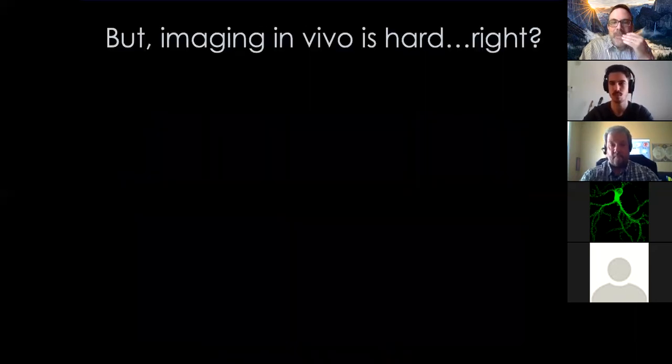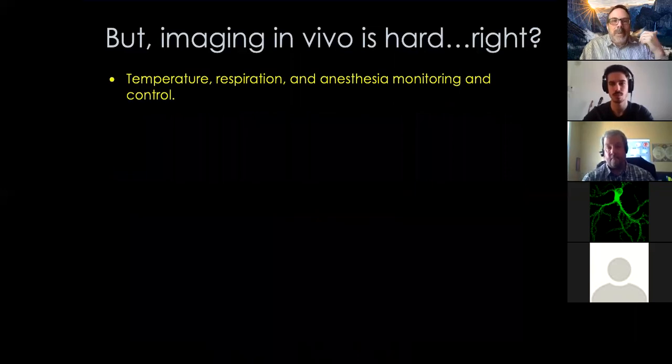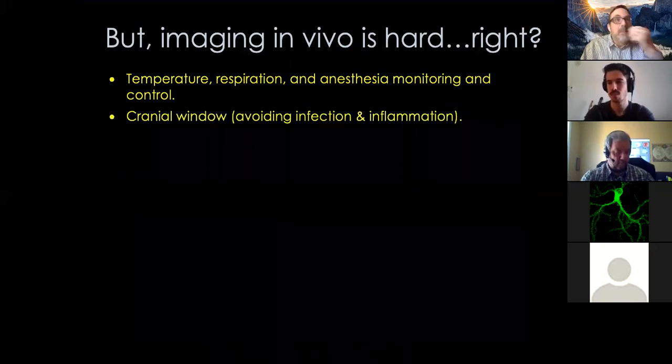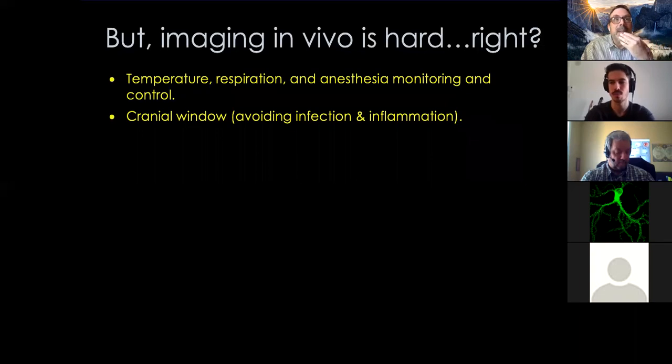But it's hard to do in vivo imaging, right? So if you put a mouse under a microscope, you've got to control body temperature, make sure that its respiration is good, anesthesia monitoring, right? All of these issues, if you're working with an animal that's anesthetized, to get stable images. You've got to make a cranial window, and there's a number of different approaches for that, but it's all quite open to complexity, like infection, inflammation, things that are often overlooked, the consequences of heating.